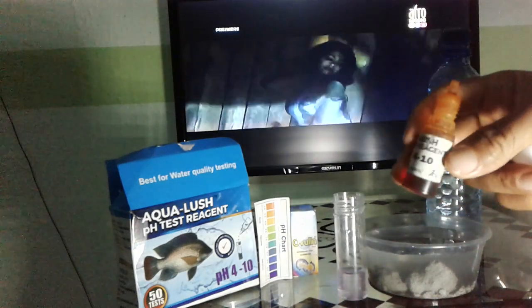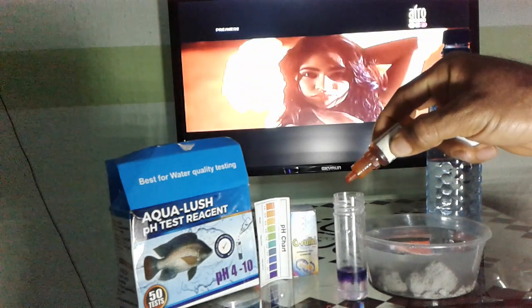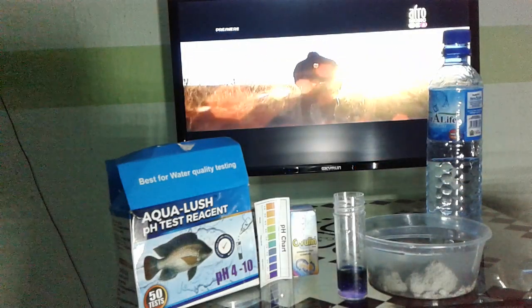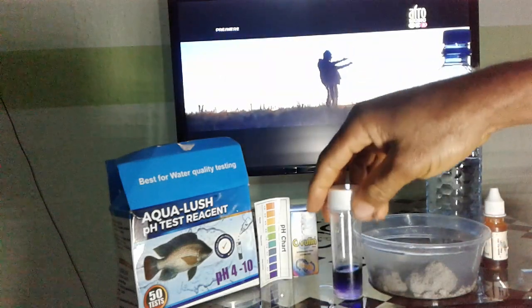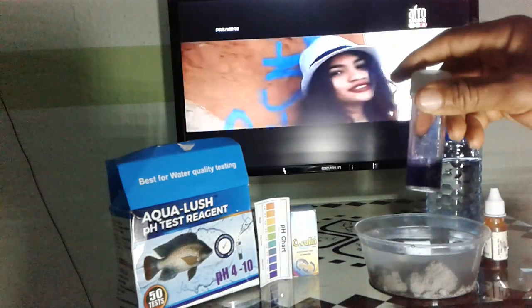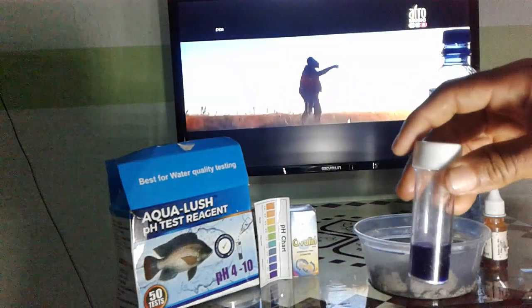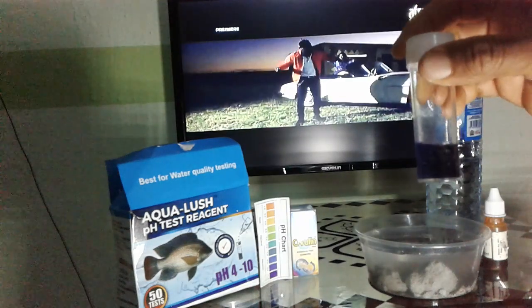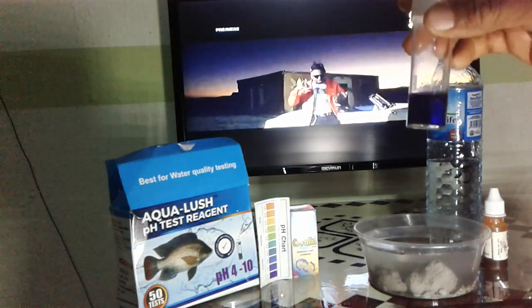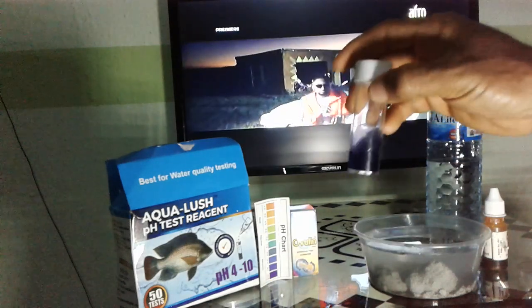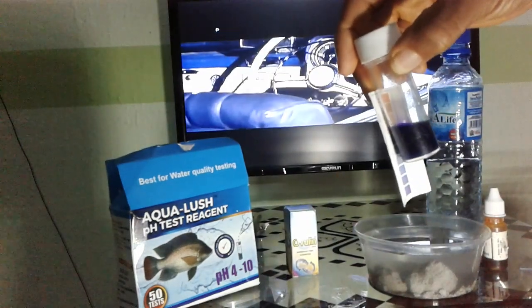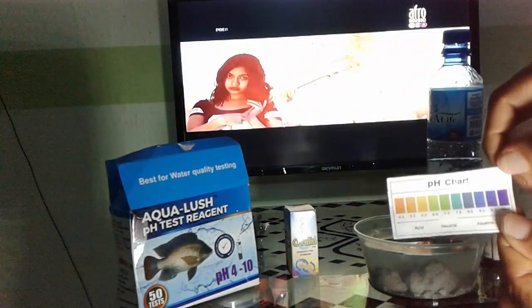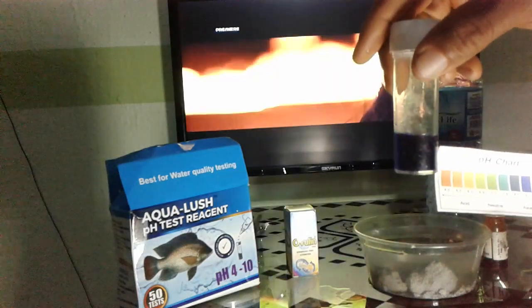I'm going to drop three drops of this into the test tube. You can see the color — this is purple. This is the color. Let's take it straight to the chart. This is the pH chart, and this area shows that water is acidic, and this area shows that water is alkaline.